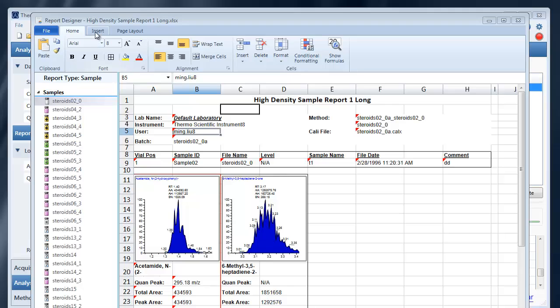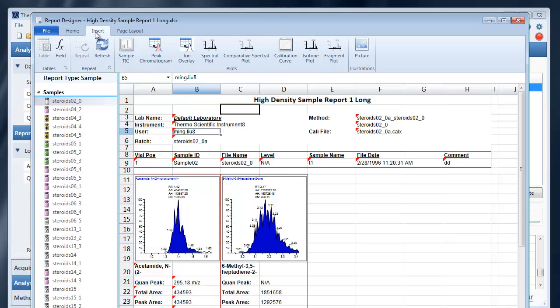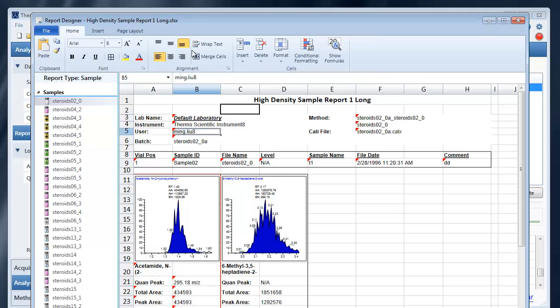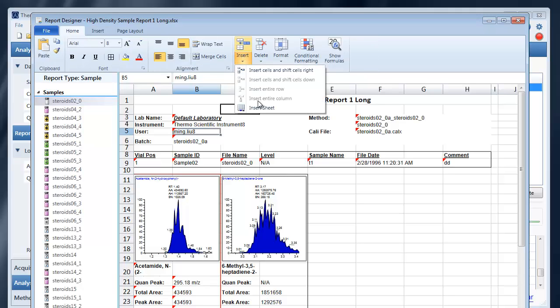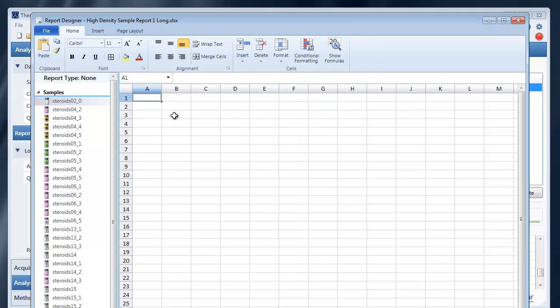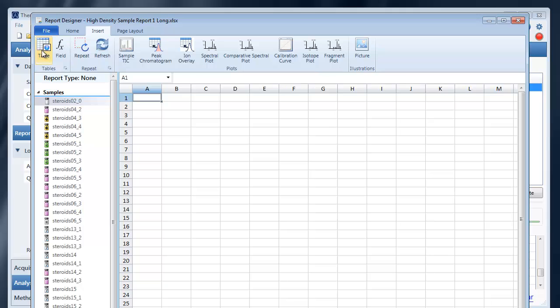Next let's talk about the insert tab of the ribbon bar. Let's go ahead and insert a blank sheet and let's drop on a table.